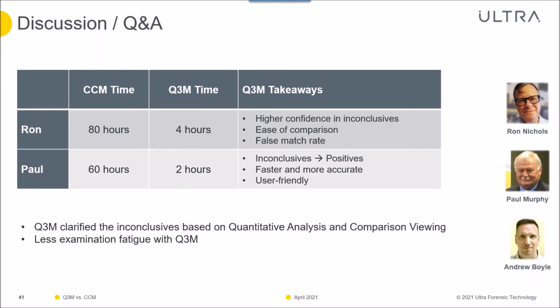All right. And Ron, do you have concerns about calling a match on a pairing that has a low FMR index, something that's below that separation line, rather than something that's comfortably above it, let's say? Anything that's comfortably above it will be much easier. Things that maybe have a low FMR index or maybe below that separation line, if there's sufficient correspondence in an area that really does indicate that these two items share a common source, I wouldn't hesitate at all.